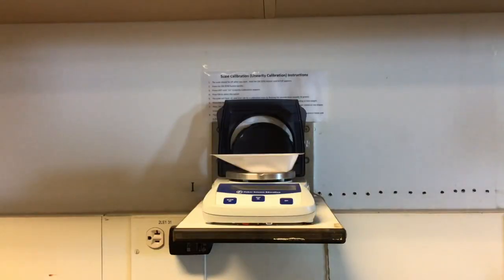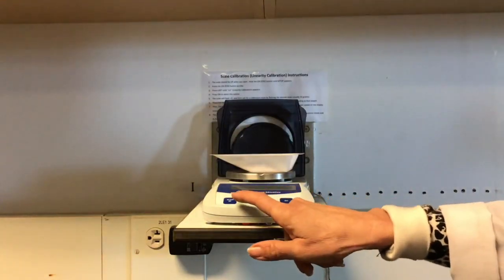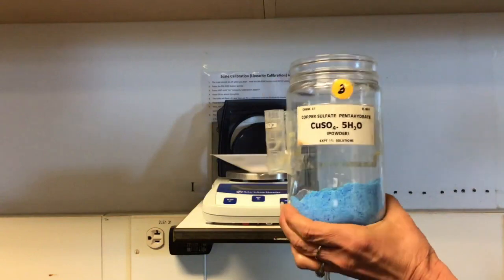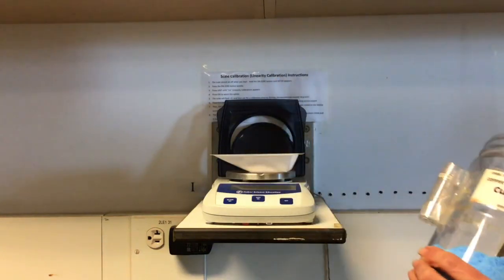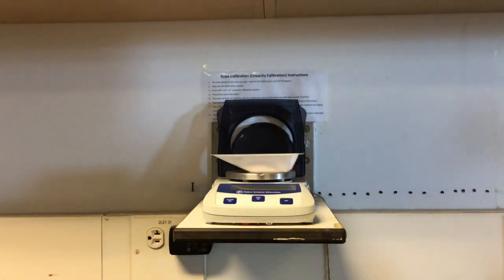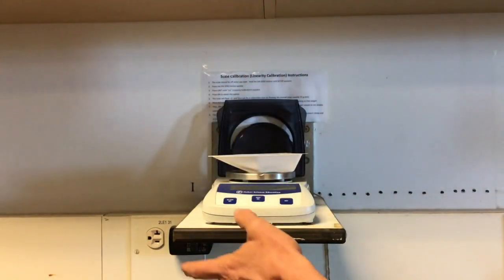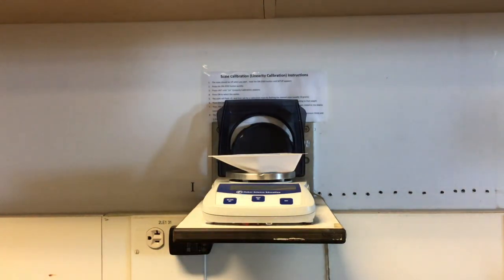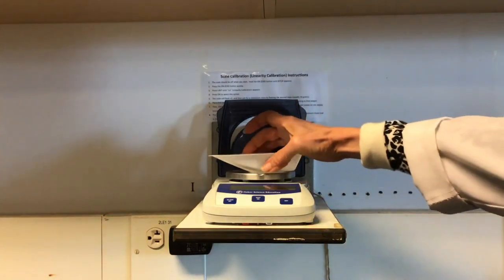I have put a weighing boat on the scale here. You want to go ahead and push the 0 button to tare that, which means we are going to be subtracting the weight of our weighing boat, automatically done by the scale. Now we're going to add 0.5 grams of copper sulfate pentahydrate, these lovely blue crystals. Okay, so I have 0.498 grams, which is close enough to 0.5. We need approximately 0.5 grams. So we'll go ahead and add this to our water.